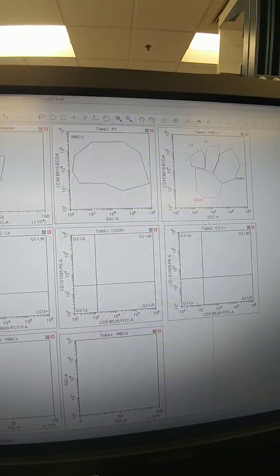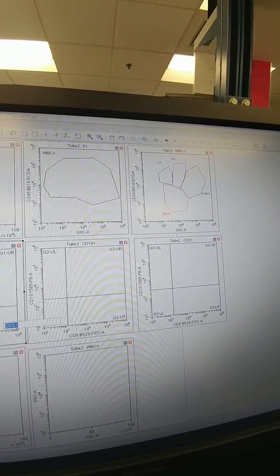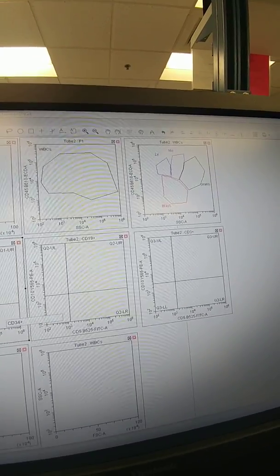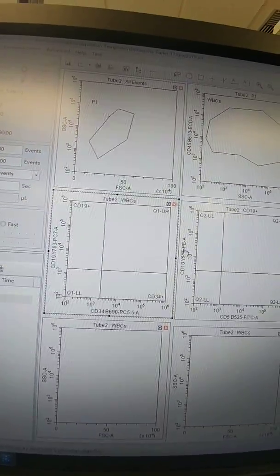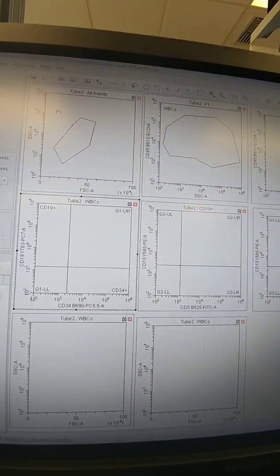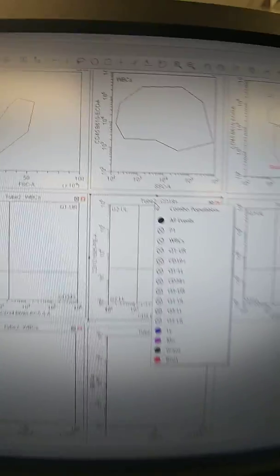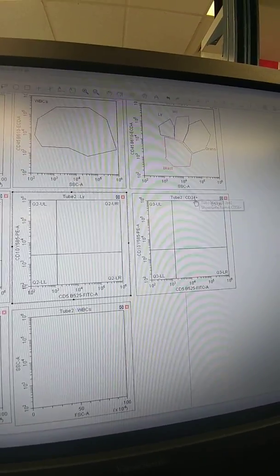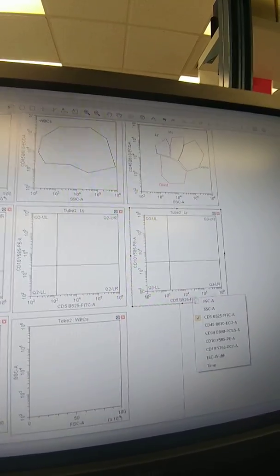So now, these will always stay the same up here. So now we need to double click that and change that to CD19 and CD34. And on this one, since it's 34, let's look at all WBCs. Okay, then you have 10 versus 5. We can change this. Let's change this one to lymphs, this one to lymphs. 10, 5, 10 versus 19.